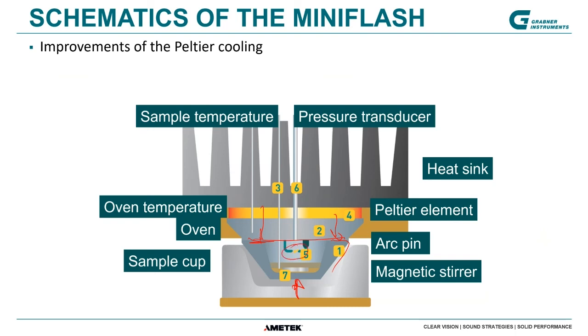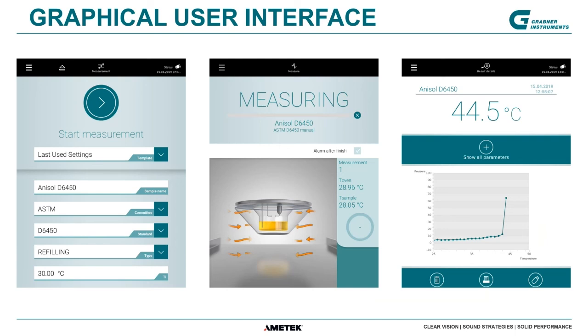And we have a spark source here, like a sparking plug in a car engine. And of course, for checking if the vapor is burning in here, you need to apply some air, and this air is supplied in here. Now, if you have a flashpoint here, of course, you have a pressure which is building up, and this pressure is then getting out here, and at the end, you have a pressure transducer. And this is how we are detecting basically the flashpoint.